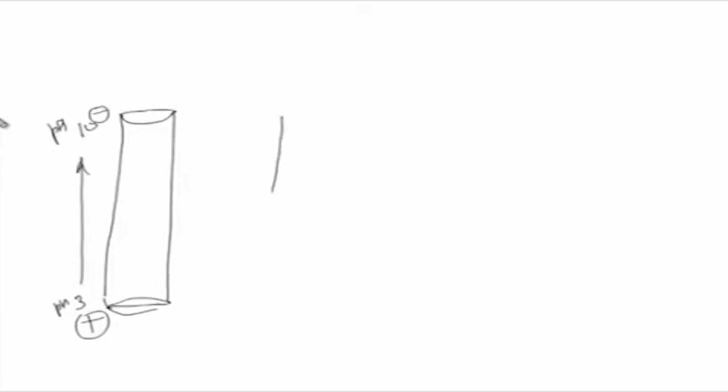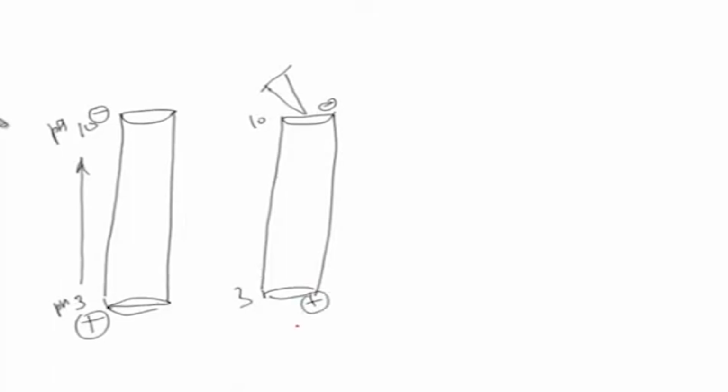So, what is done next? Here you have to load your sample protein. Now, remember protein could be loaded anywhere, but it could be loaded on one side. You have a particular pH here, a negative and positive electrode.